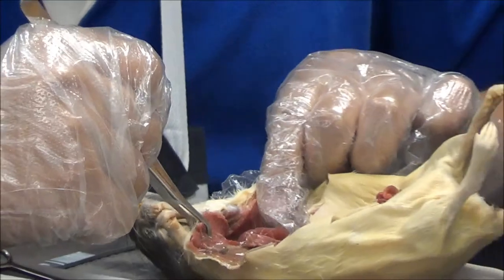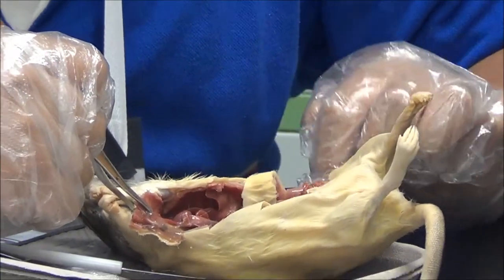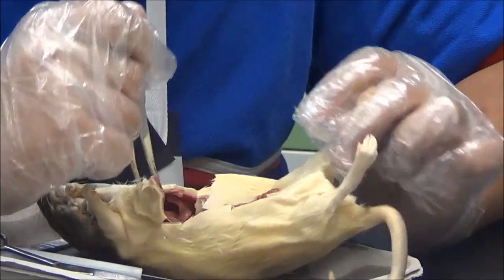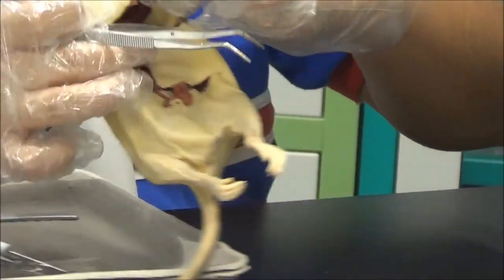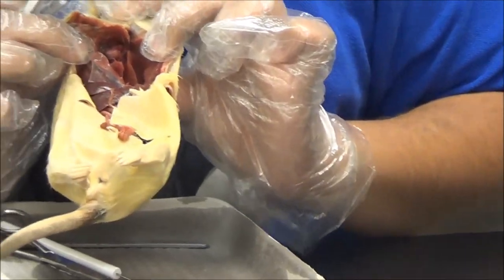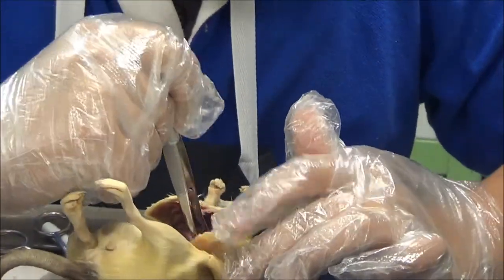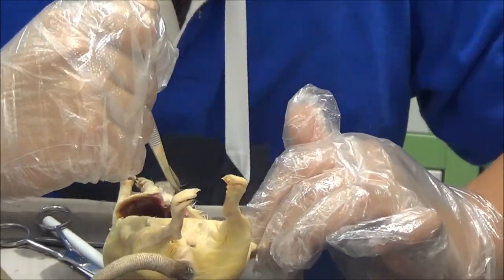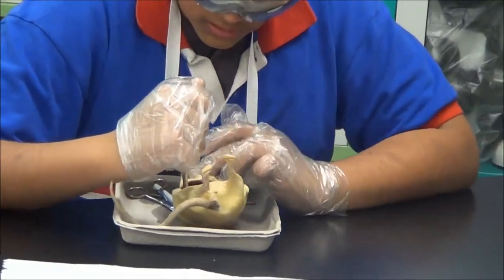Once this is done, you will be able to see all other organs such as the pancreas, kidneys, bladder, and neck muscles. This is how it will look at this point. You may choose to cut off parts of the stomach and the liver to actually grab the liver and expose it, but for this video I will not be doing that.